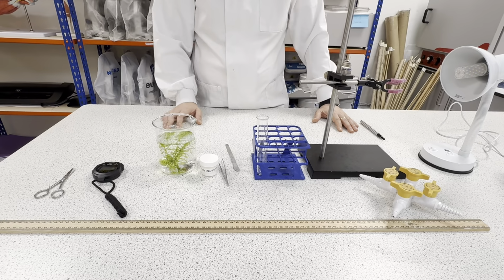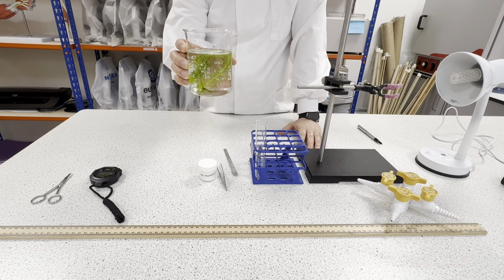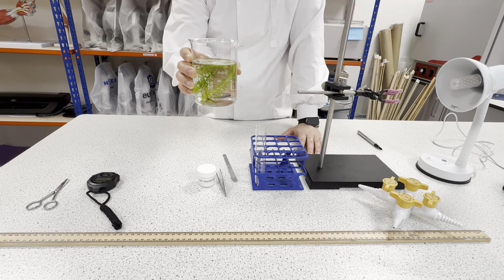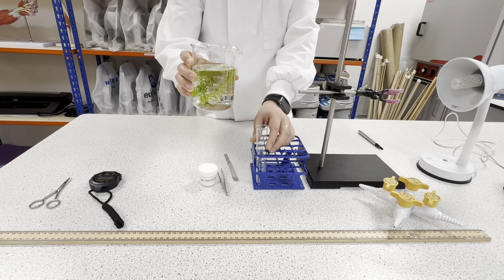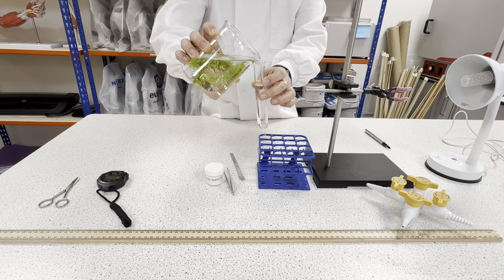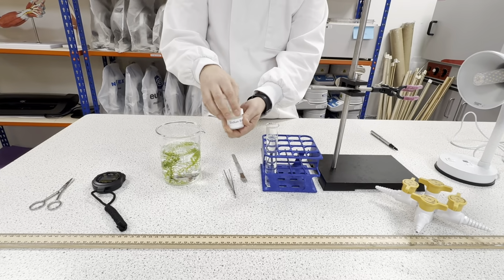So the first thing to do is to add my water. This water I took from my tank. It's better using water from the tank because the plants will be used to that pH and temperature, and you won't have stress for the plants, because you can use them again and regrow the plants again. So we will add the water here inside my boiling tube. I will place my boiling tube back, and then I will add the CO2.